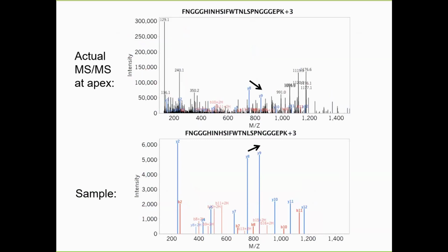So if I try to extract that specific peptide out of the DIA data, this is the MS2 fragmentation spectrum at the apex of that peak. There are two things that I think are important to know. One is that, as it's pretty clear, these spectra that we're trying to dig these peptides out of are actually fairly complex MS2s. And consequently, it's a bit difficult to make the determination of the peptide. And using these chromatograms is really the only way to figure out that this is the true peptide that represents this at the apex of this MS2 fragmentation data set.